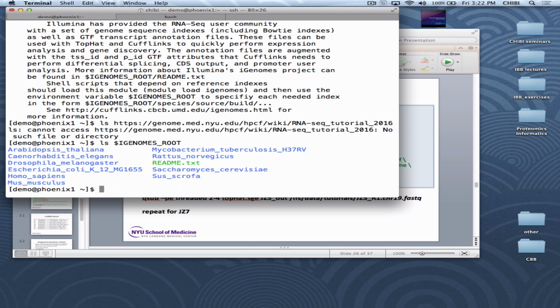Why do you need the variable to point to the file path? Why can't you just point to the file? Yeah, that's a really super annoying thing. The file path changes depending on where you are in the system. The head node sees it differently than the worker nodes, so always use the variable name. Sorry, can't be changed.